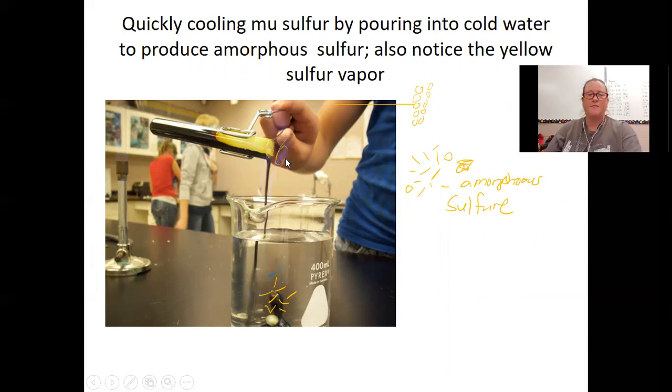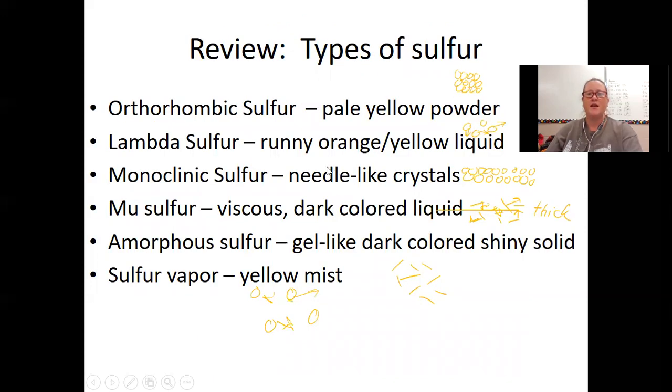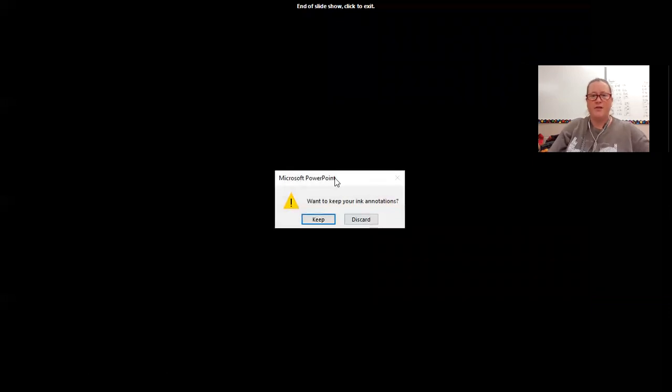Sometimes it does, but these are all physical changes that involve melting, vaporization, and recrystallization as these energy transfers take place when we add the energy, and then the energy leaves the system as the system is cooling down.